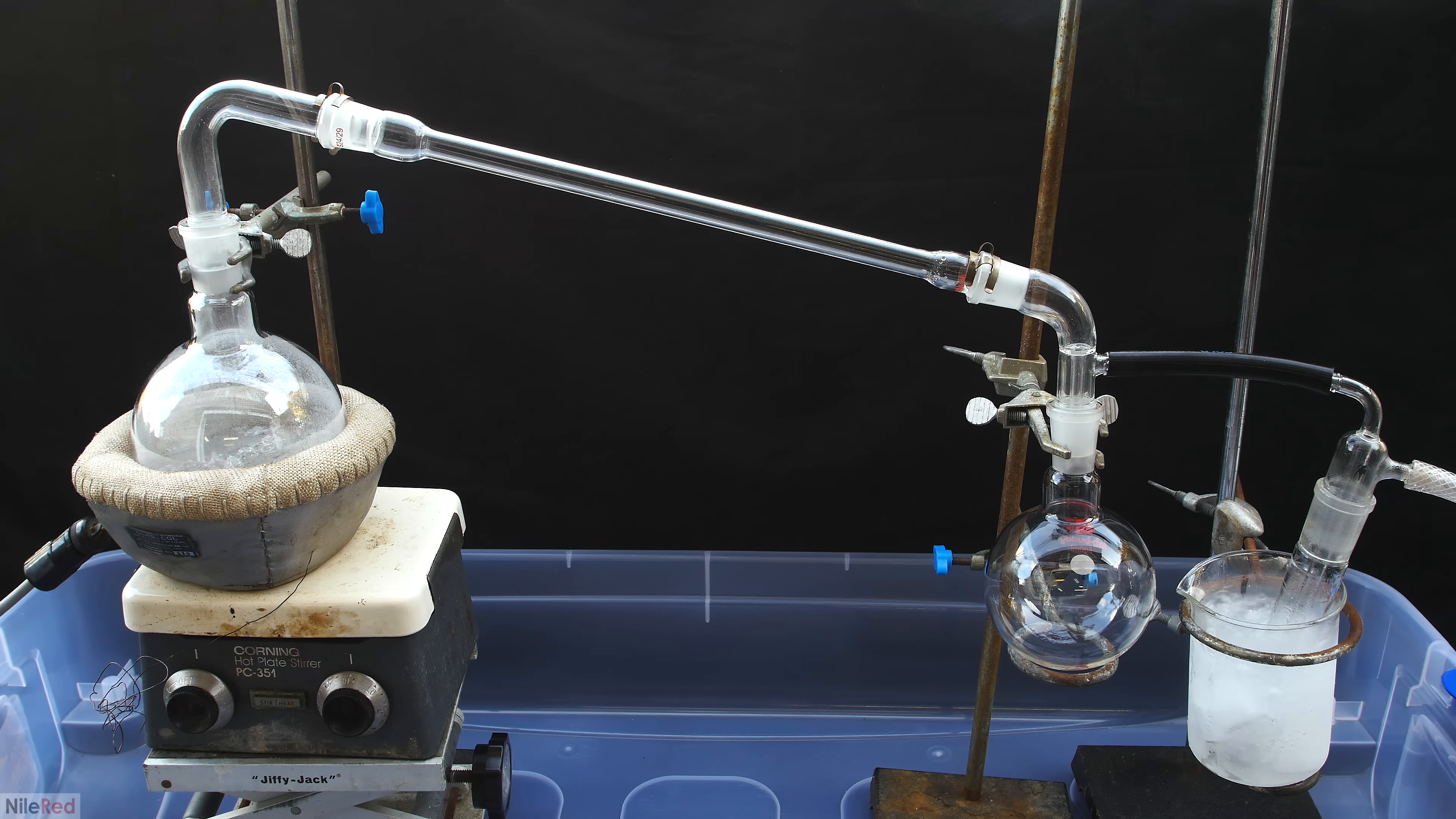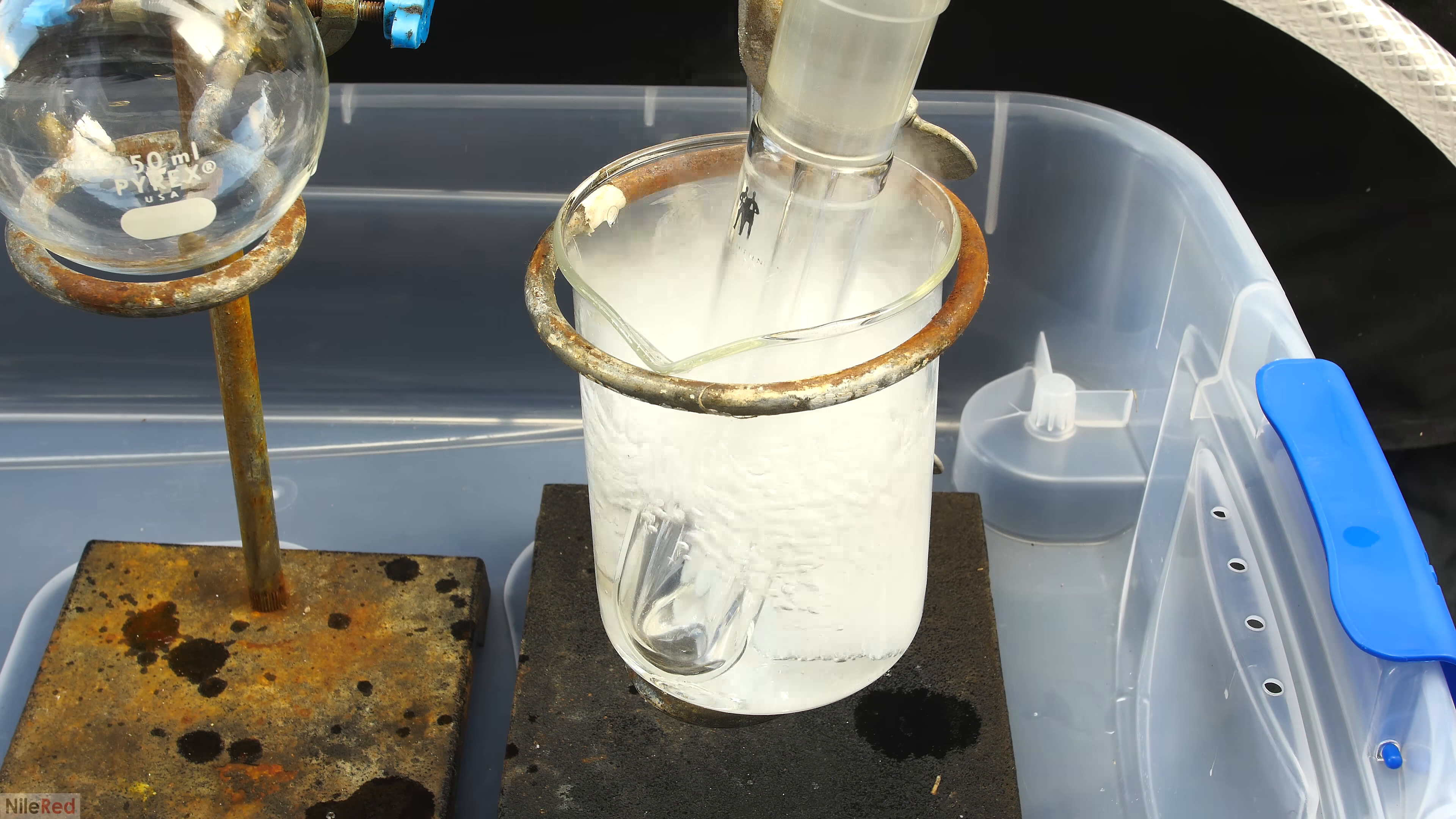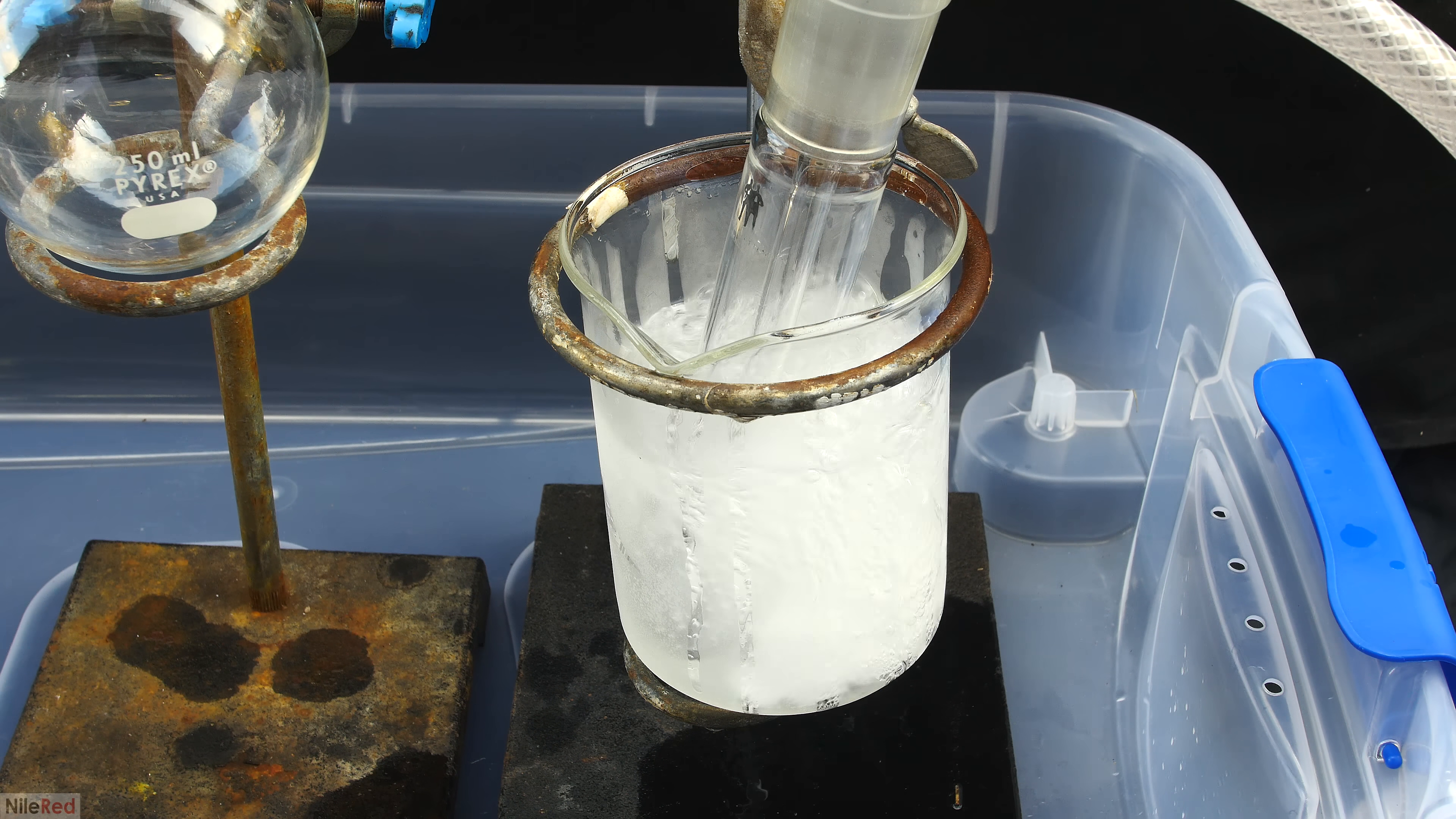In the beaker on the right, I also set up an isopropanol dry ice bath. This cold bath is really easy to set up, and all I need to do is pour in some isopropanol, and then drop in some dry ice. It's more common to make a dry ice bath using acetone, but I unfortunately only had 99% isopropanol on hand. When the dry ice is added, there will initially be a lot of bubbling as the isopropanol cools. After just a few minutes, it should settle down and become much more tame.